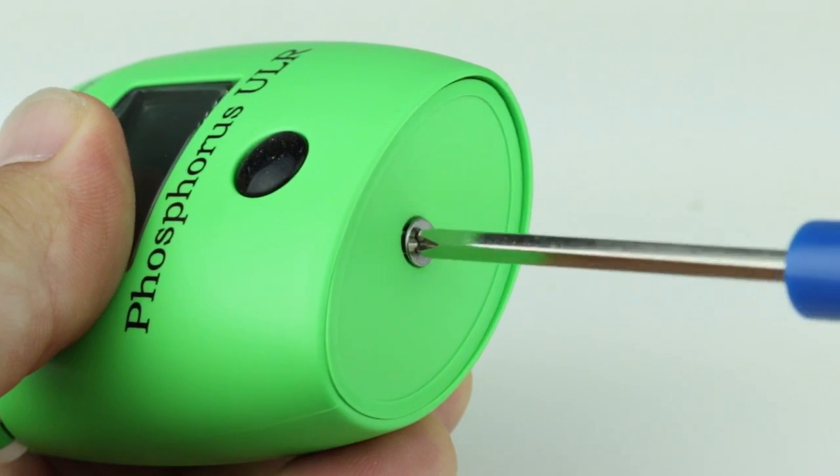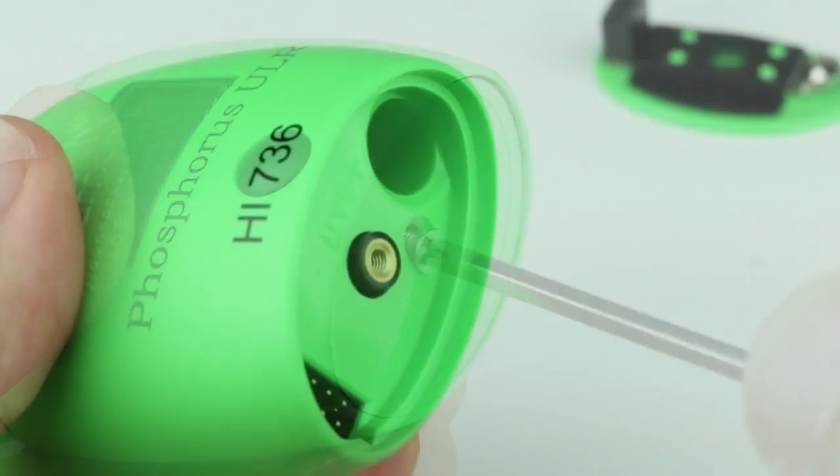When you first receive your checker, install the battery in the compartment on the underside of the meter.